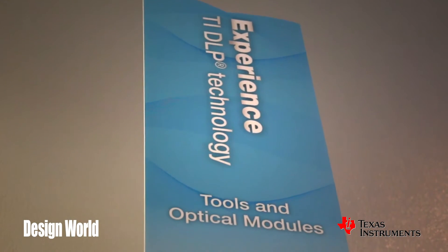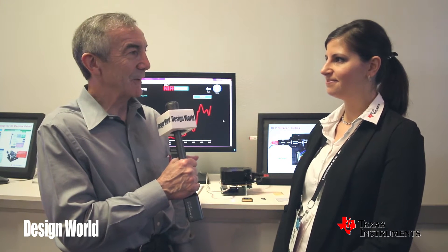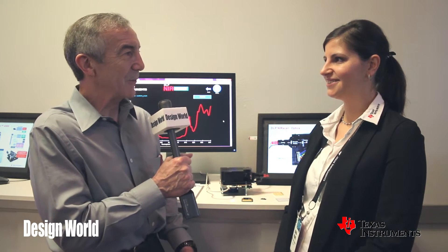We're here with Gina Park, a product line manager at Texas Instruments. She's going to tell us a little bit about an interesting application for TI's DLP optics chip. These things are usually used for displays, but she's actually got this thing used in a spectrometer. Tell us how you do that and why you would do it.